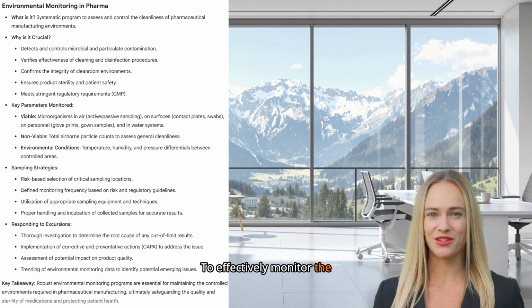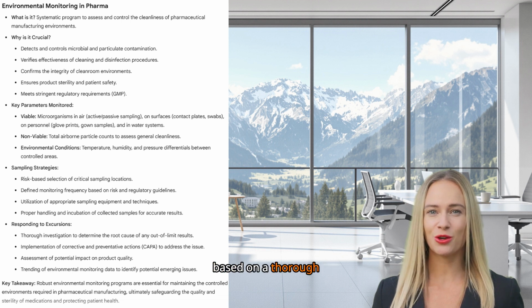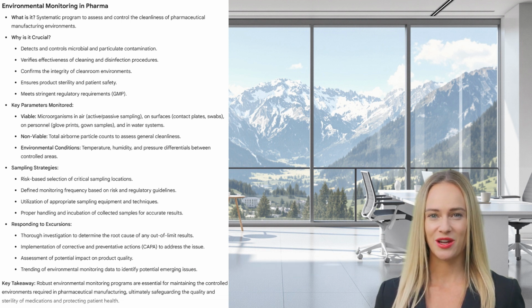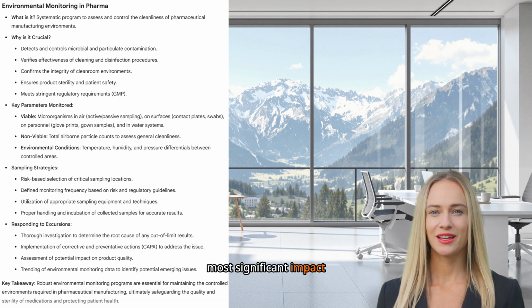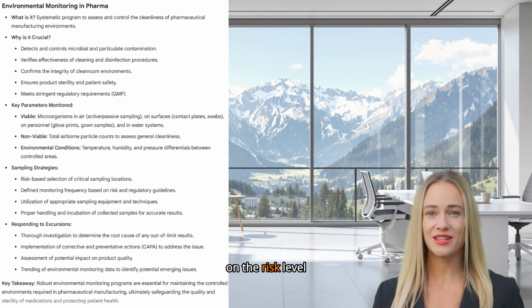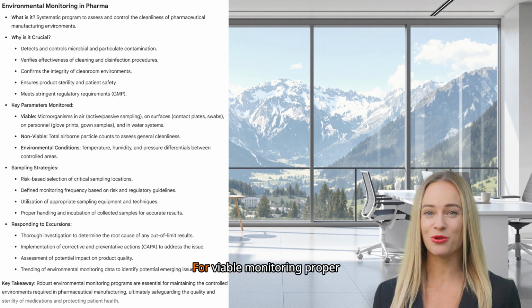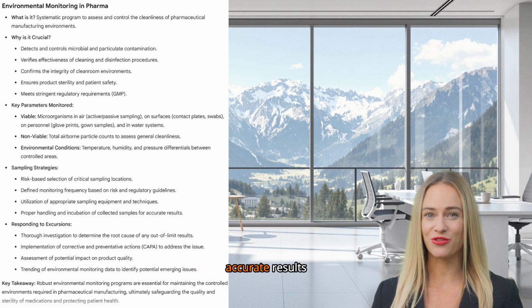To effectively monitor the environment, it's crucial to establish appropriate sampling methods and locations. These are typically defined based on a thorough risk assessment, identifying critical areas where contamination is most likely to occur or could have the most significant impact. The frequency of monitoring is also determined based on the risk level and regulatory guidelines. Various types of sampling equipment and techniques are used, each with its own specific procedures. For viable monitoring, proper handling and incubation of samples are essential for accurate results.